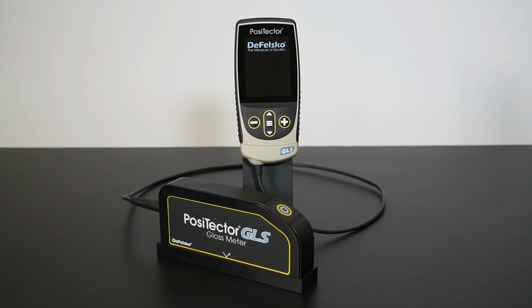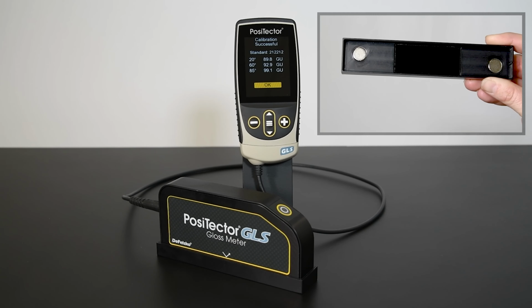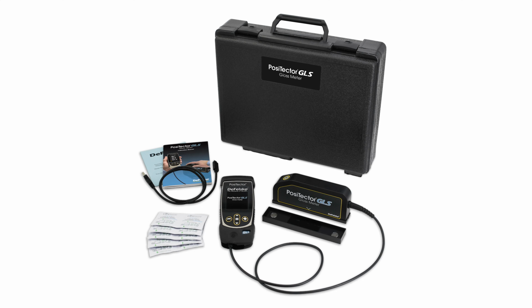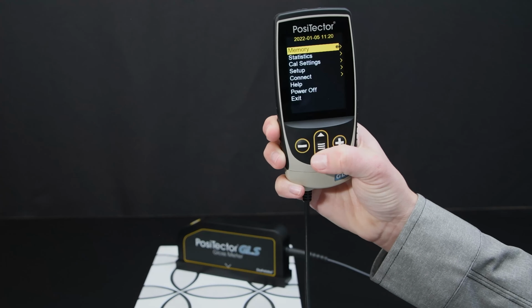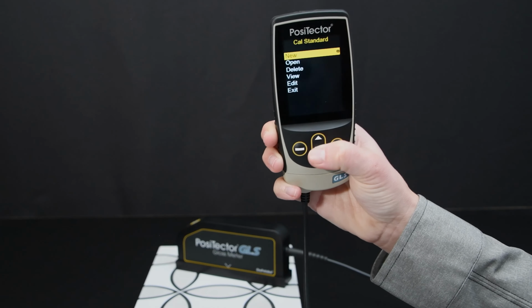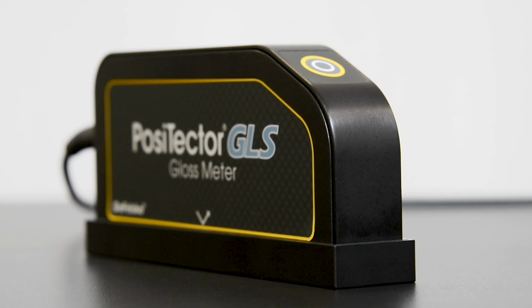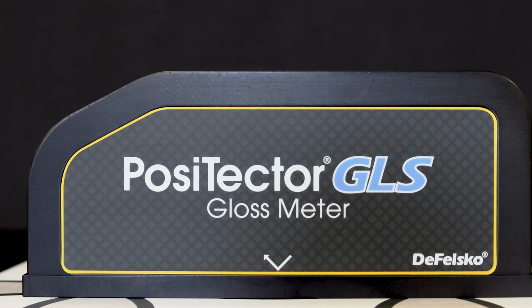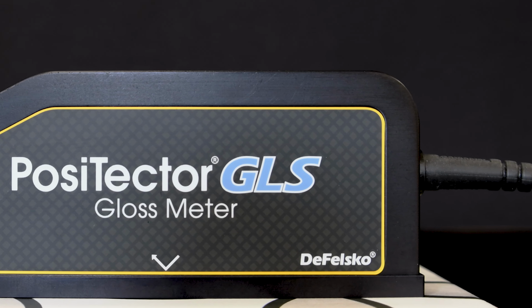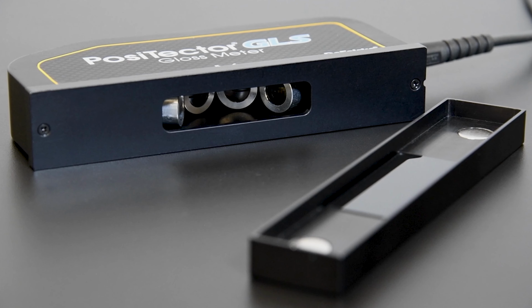When powered on, the probe performs an automatic self-check and calibration using the calibration standard incorporated into the protective base plate. A traceable certificate of calibration for both the probe and the standard are included. For some applications, it may be desirable to calibrate the probe to a different calibration standard. Easily add and manage up to 99 different standards. The durable, all-metal probe is designed for long-term stability and a long service life. It is connected to the PosiTector gauge body via cable, making it ideal for measuring tight or awkward applications.